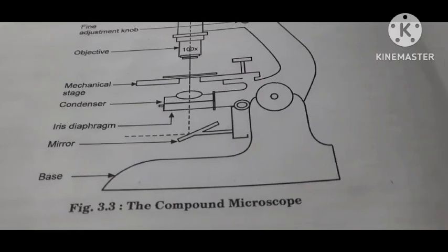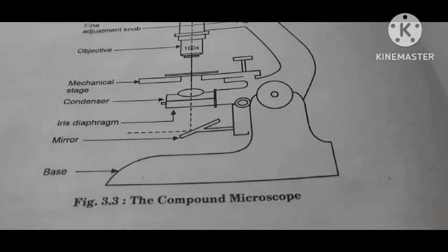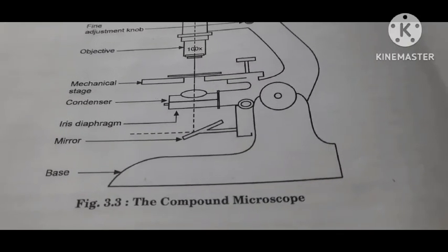Good morning students. In today's video we are going to learn more about the compound microscope.